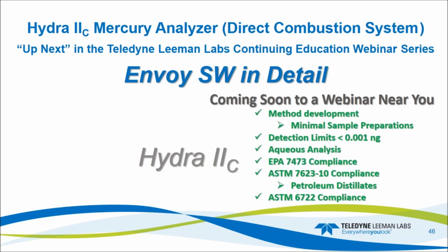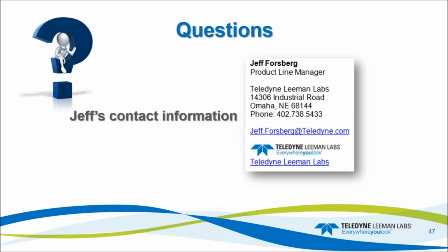We'll look at detection limits, aqueous analysis, and how we are compliant with some of the standard methods like EPA 7473, 7623 from the ASTM for petroleum distillates, and then also we'll look at the coal and fly ash method 6722. Anyway, so that's some of the future webinars that you'll see coming your way. So if you want to learn more about the software, that's the one that's coming up next.